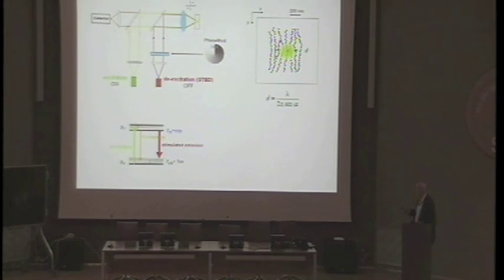And because of that, the opposing parts of the wavefront, if you put it here in the beam, will be out of phase by pi. And this is why you don't get, say, a blob of light here, you get a ring. But as I said, the ring is also diffraction limited, so that's not what gets smaller.